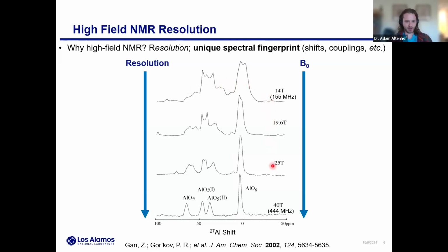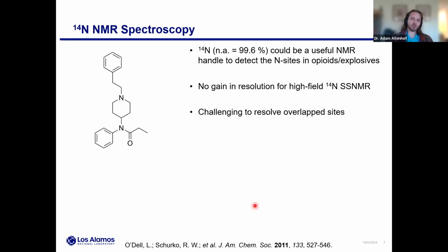Really, you have to go to higher and higher field, where you ultimately hit this regime, which is quite nice. You're basically just having one peak per aluminum site. And at the end of the day, this is what everybody in NMR would like to measure, this very high resolution, straightforward spectrum. Really, if we were developing an aluminum detector, this would be the kind of spectra we'd want, right?